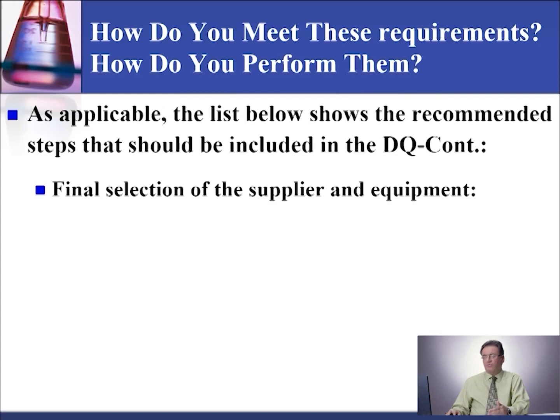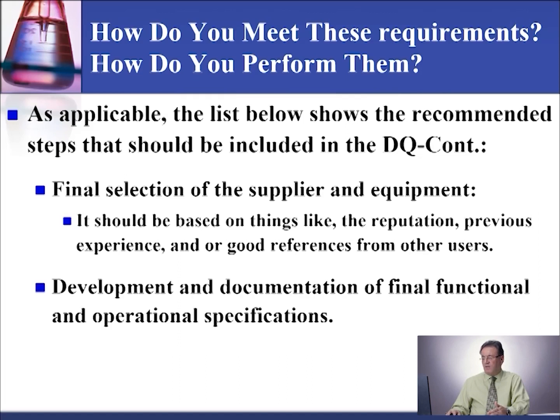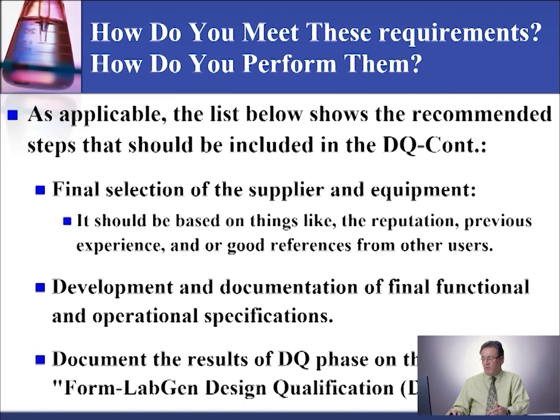Some notes regarding the process. Some activities normally undertaken in the operational qualification or performance qualification may be satisfied during the installation and startup of the instrument. This is sometimes referred to as site acceptance testing. There needs to be a logical, specific order to the qualification activities. For example, installation activities must occur before the operational qualification can start.